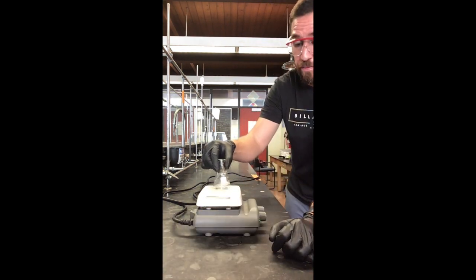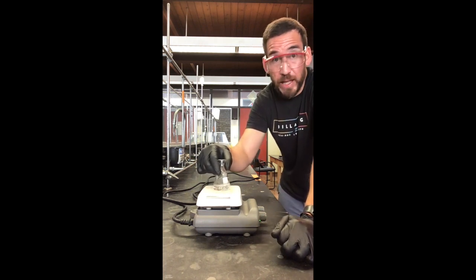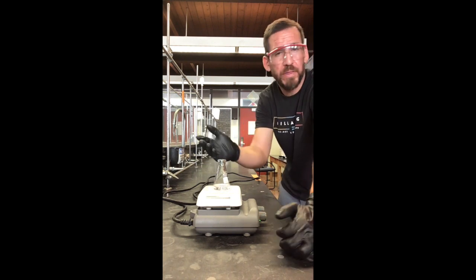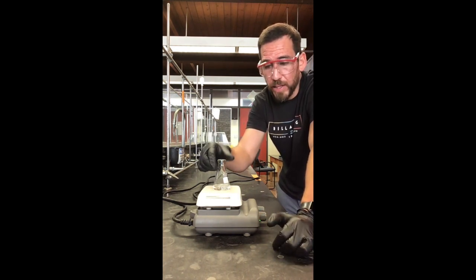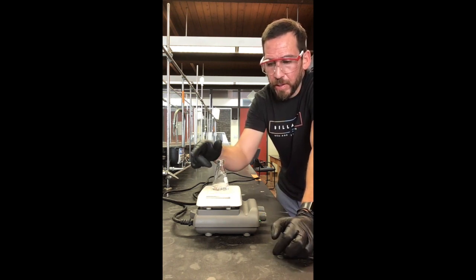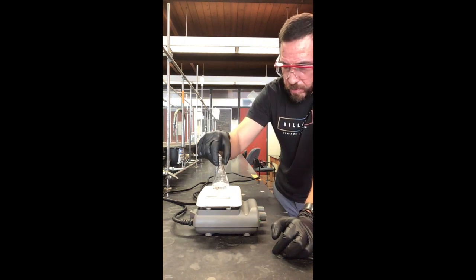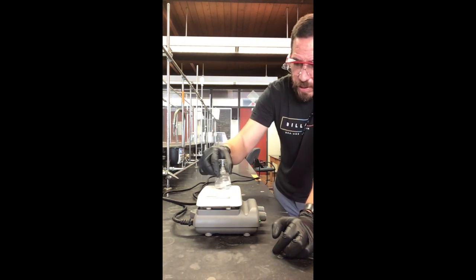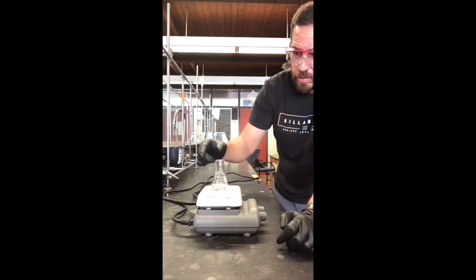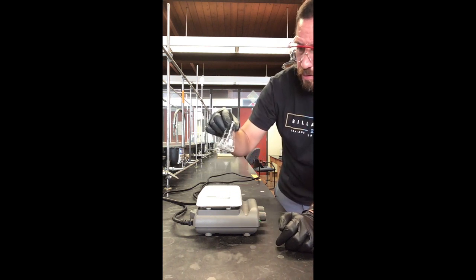So I really feel like that's all we really need. Sometimes you could even add less than that. It just really depends on how much sample you're working with. We're working with 500 milligrams, which is quite a bit, and so 8 drops is totally fine. And we are looking pretty good. Let me get this boiling again. There we go. I think all of it's gone.